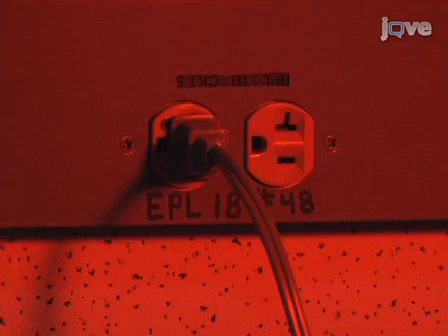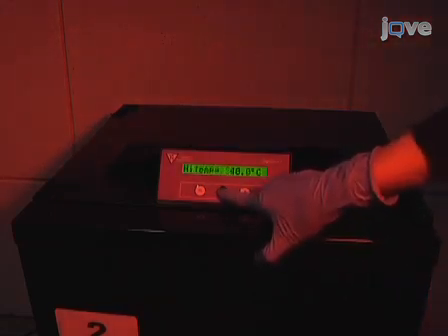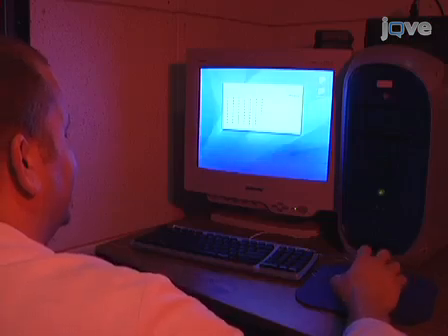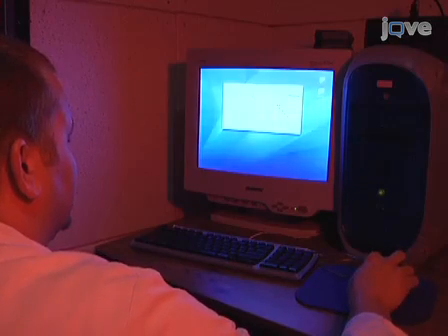Connect the UPS emergency backup unit to the emergency backup circuit of the building if available. If the system controlling the lighting in the incubator is not directly regulated by the incubator, then it is sufficient to plug the incubator into the emergency power without a UPS, as loss of power for a few seconds will not affect the chamber temperature. Next, set up a computer, PC or Macintosh, fully dedicated for data collection and/or for light control of the incubators.